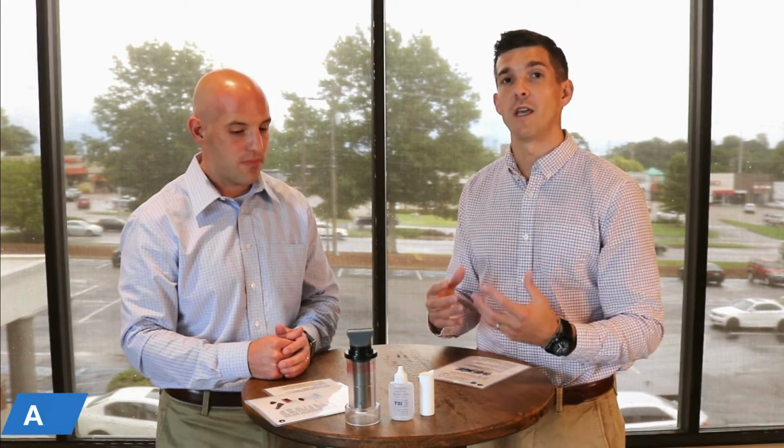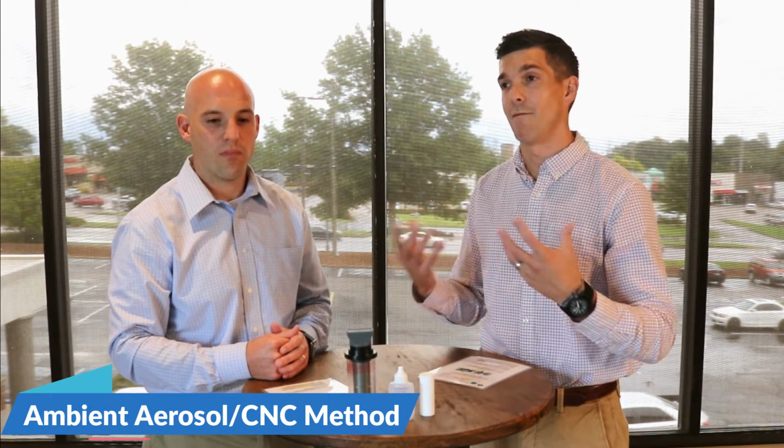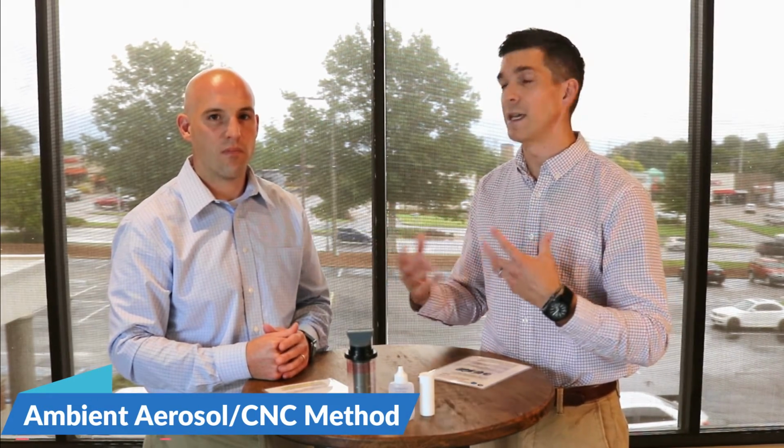So let's move to ambient aerosol. Yep. We covered this in other videos. Ambient aerosol is a technology that uses particulates in the ambient air, compares them to particulates inside the mask, and tells you if you have too many particles or a leak, and gives you fit factor and pass or fail on the respirator. It's really that easy. But the requirements there are you have to have enough particles, which we cover in another video, but then you lead into consumables to run this.